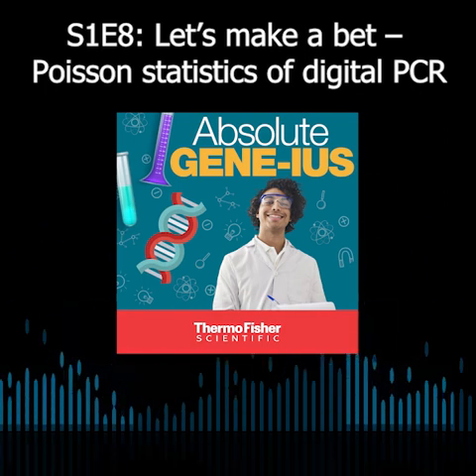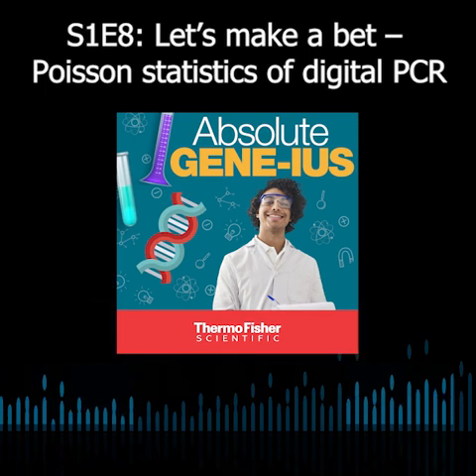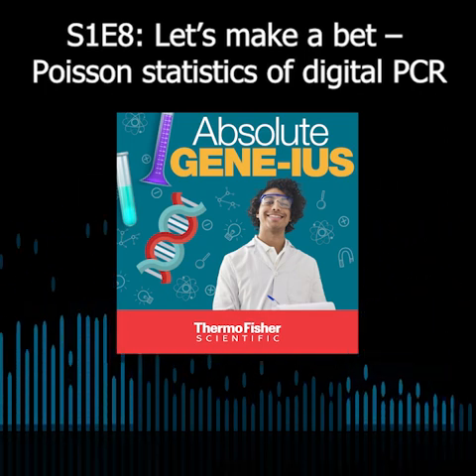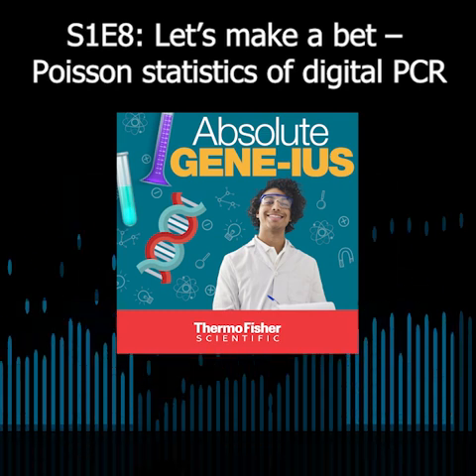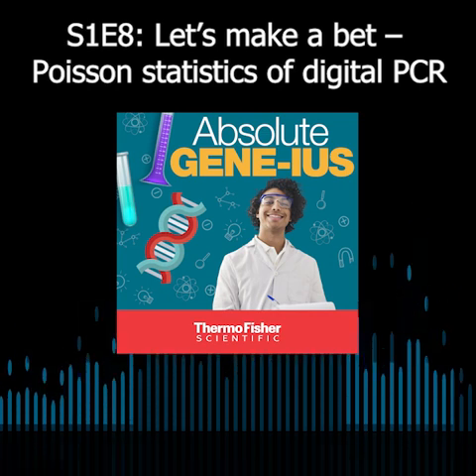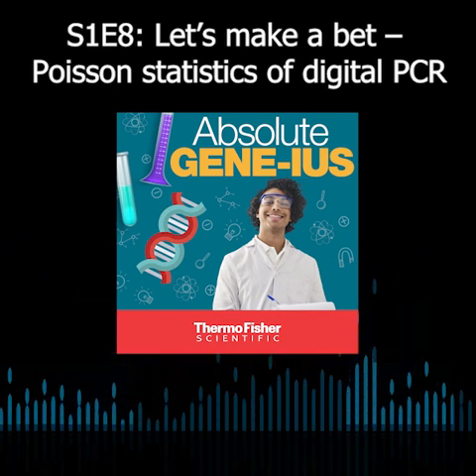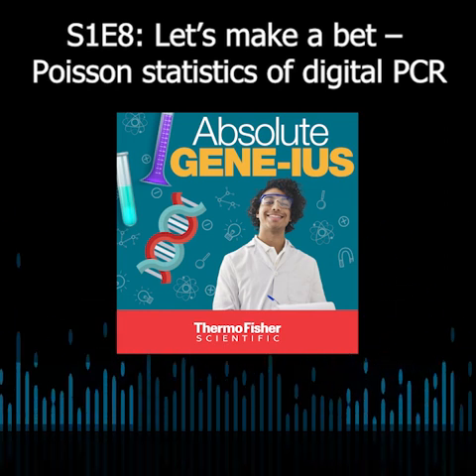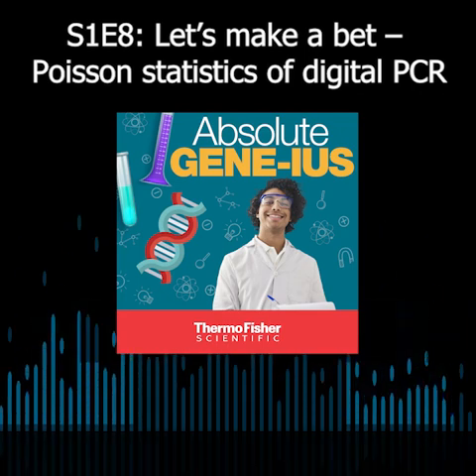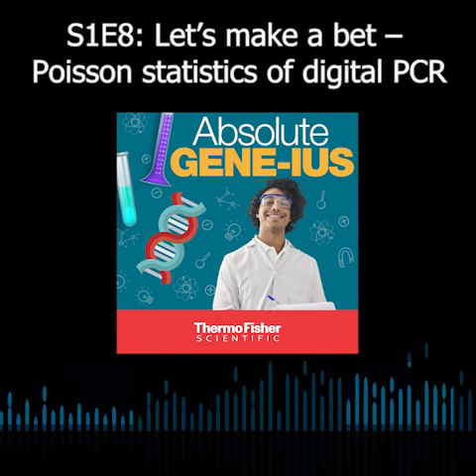And if you have some background fluorescent signal, you don't know if that signal is just background noise or truly weak amplification. The absolute Q is a little bit unique in that it does create background images for every single run to then subtract out that noise. So it's not truly a simple endpoint detection. It's a little more sophisticated with that background subtraction, which gives you more confidence in the answer you have at the end. And that's extremely important if you're working with lower concentrations of targets.